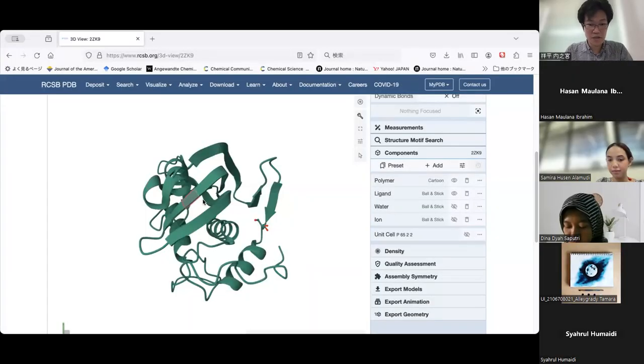I have a question about the type of instrument that can determine the 3D protein structures in the sample. The 3D structure of a sample, okay. X-ray crystal analysis can provide the 3D structure of samples. For example, I will show you. Please wait. The 3D structure, yes, this is a very important point. Can you see this slide? I will show you.